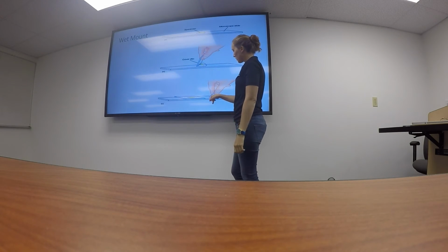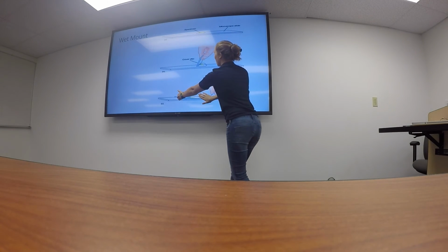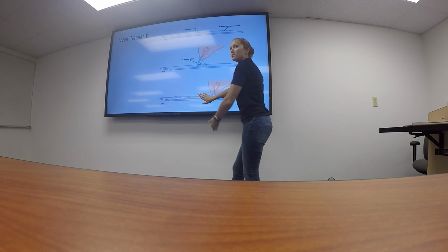Then we're going to take some sort of paper towel or a Kimwipe, put it close to the side, and let the water or the liquid diffuse through.